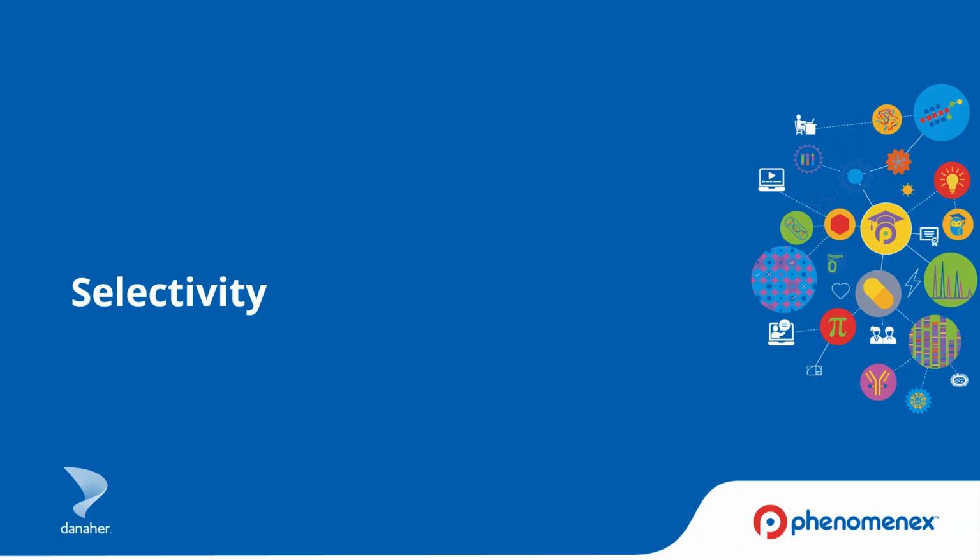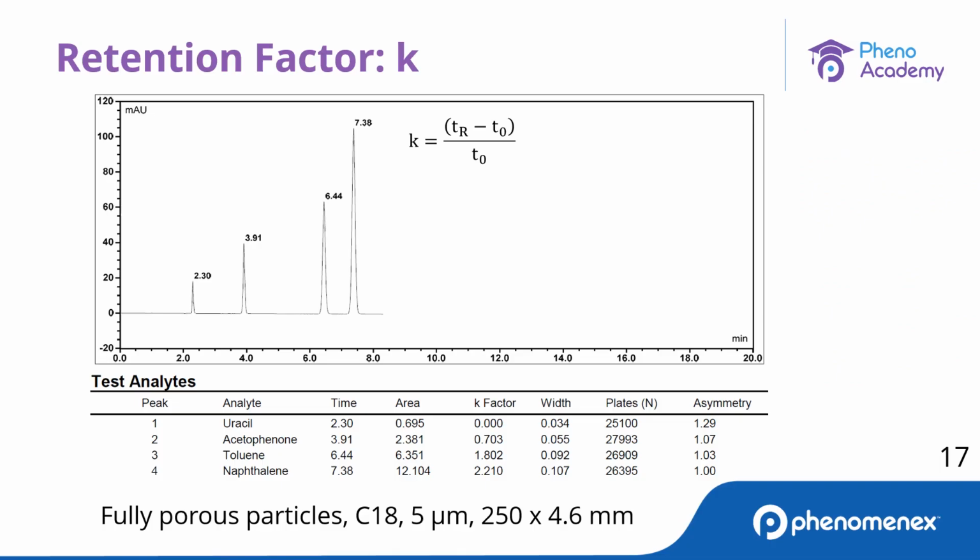In this next part, I will cover selectivity. Before we can talk about selectivity, though, we need to talk about the retention factor. This is also called capacity factor or relative retention. The retention factor is the retention time of an analyte, TR, relative to the time that unretained compounds, so T0, elute.